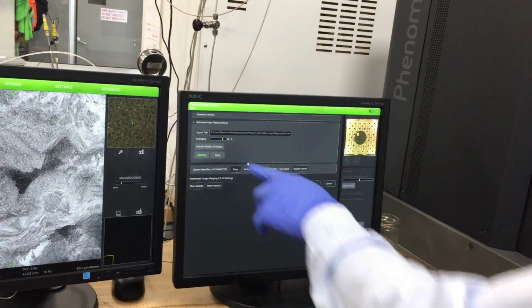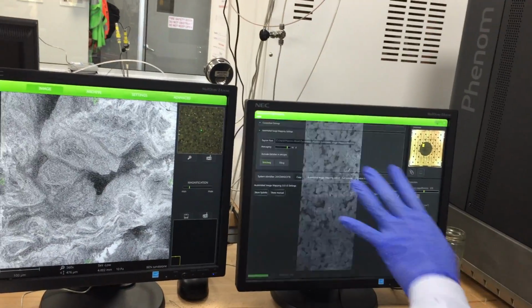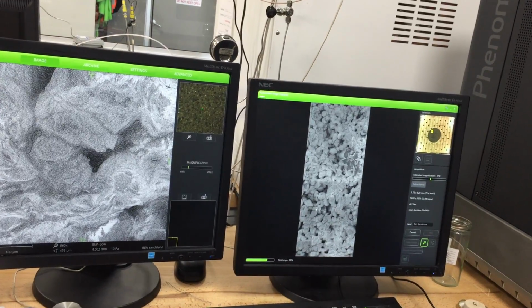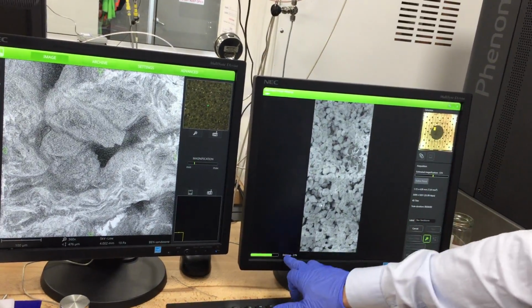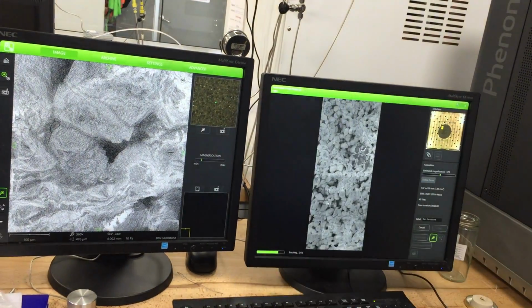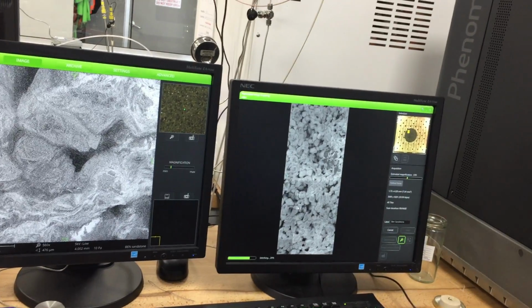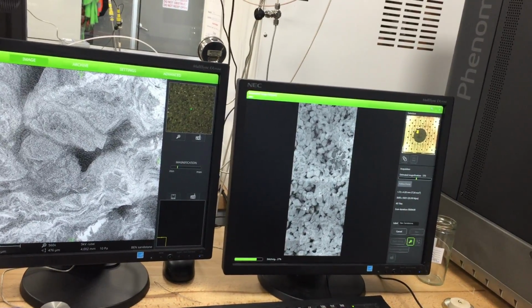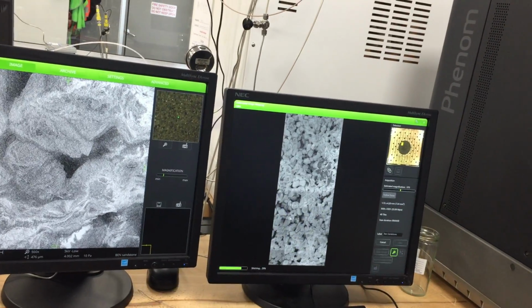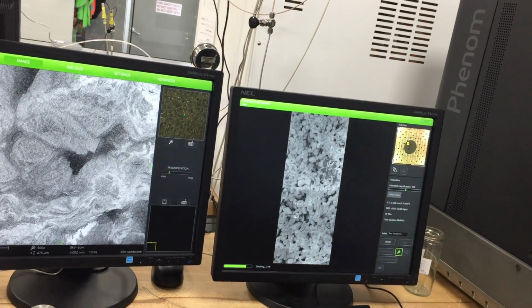In here, if you just use tiling, it's quicker. However, you can see that some of them are not properly matched. After this, it'll take a while. Now it's stitching. It will try to put together better matching, so the picture looks better. So within 5 minutes, you get a pretty wide area scan of a sample.